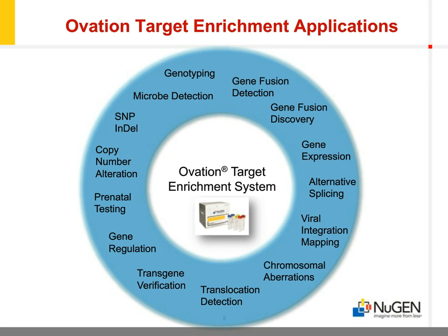An important application that requires cost-effective sequencing is genotyping, which you can see at the top of the applications wheel. Particularly in the realm of agrogenomics, a large number of sites need to be interrogated quickly and in a cost-effective, high-throughput fashion. This is the application we will be hearing about in detail today.